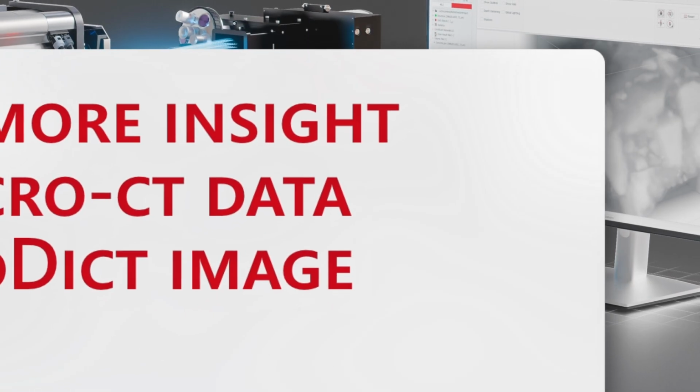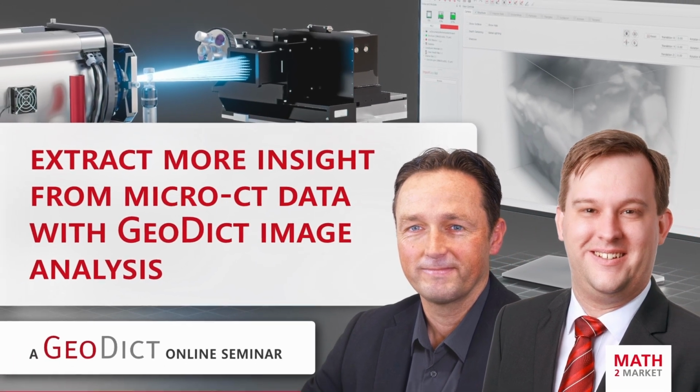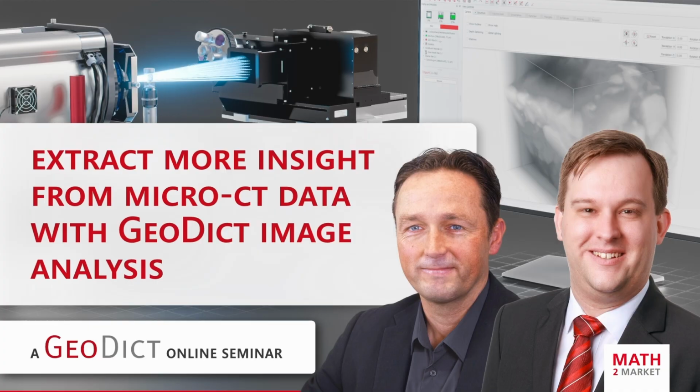My name is Anton du Plessis and I'm joined today by my colleague Jonas Scharbernack. We are happy to present this seminar on image processing and image analysis using GeoDict.